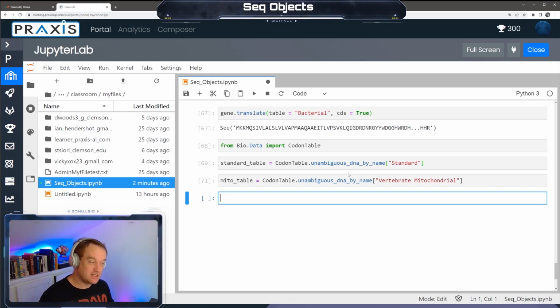If you don't put in your annotations that vertebrate mitochondrial is table 2, then when you go back to reread this in like 9 months, and I've had this problem before. When I started coding, I didn't annotate very well. Then I'd want to send the script to somebody, so I'd reread it first, and I'd have no idea what I did, because it made sense at the time, and then you forget all the nuances. So be careful with that.